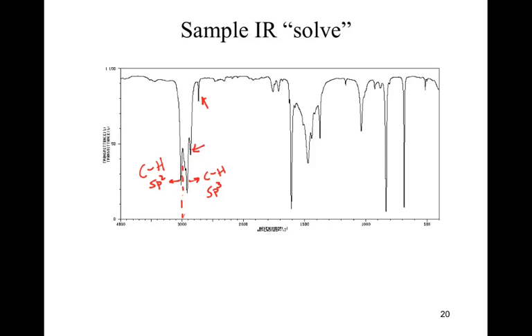If you go back and look at the example peaks, for the CH sp3s, there's usually 3 or 4 of them. Okay, so don't get peak happy or peak label happy. Go for kind of a bulk image and then hope for the best from there.